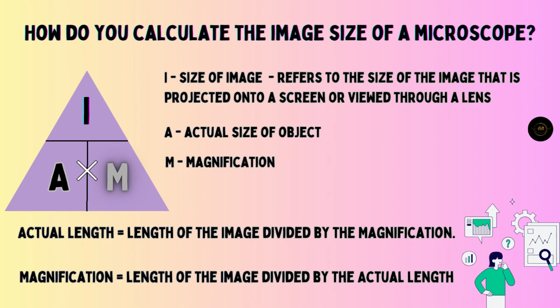You put the bacteria under the microscope and use a specific total magnification. Like in the previous task, the eyepiece lens was 10 times, and we used the scanning power, which was 4 times, so altogether it was 40 times total magnification. So the information that you use for the microscope is that the total magnification is 40. Then you observe under the microscope using this total magnification, and you see something. The thing that you see is the bacteria.